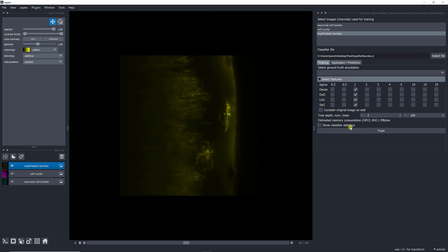When you use different scales, it's very important to keep in mind what you're doing. If I want to segment tissues, for example, I'm going to use a mix between high and low resolution. Sorry, I'm messing up here. This is high resolution because you apply a Gaussian with a small kernel.